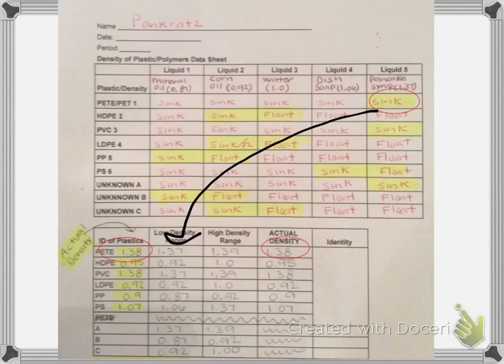And so I know that PET has a 1.38 density, so I'm going to make up my own high density range, and I'm just going to go 1/100th over what PET actually is. So PET is 1.38, so I'm going to say that my high density range is 1.39. I am only doing this for PET and PVC, and the reason for that is because we did not test it with a liquid that had a higher density than PET. So that's the only weird one there.